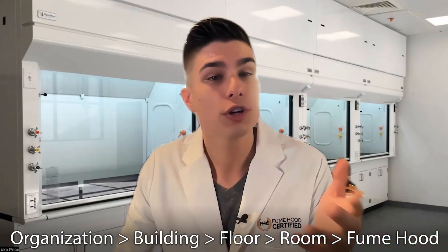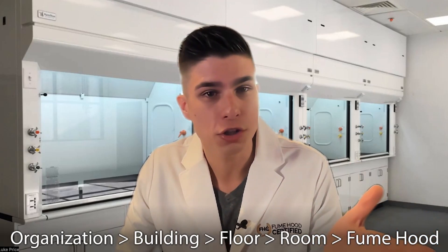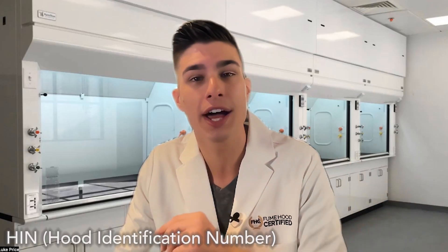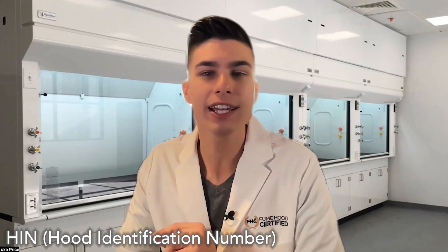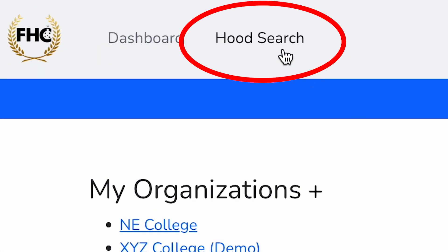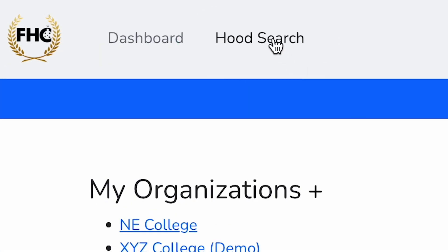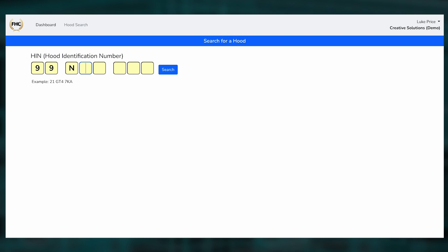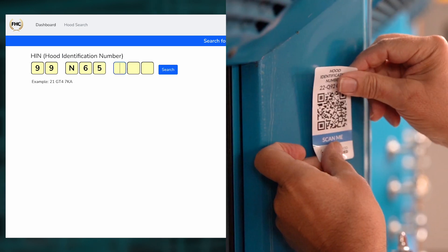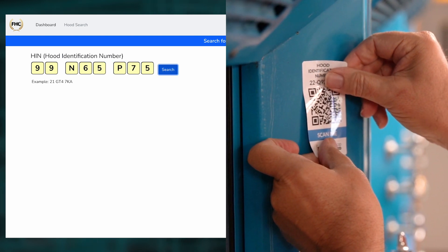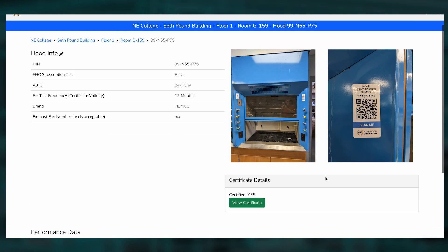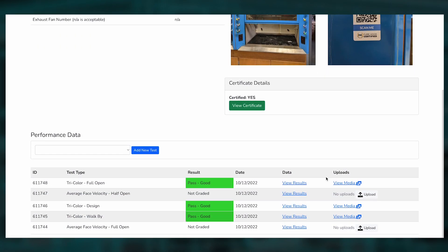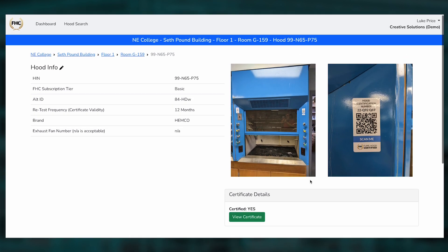You can also search hoods by the hood identification number, just by clicking the hood search button at the top of the page. Then you enter the HEN number that you assigned to the hood, and it'll automatically pull up that hood's information and test results in the software.